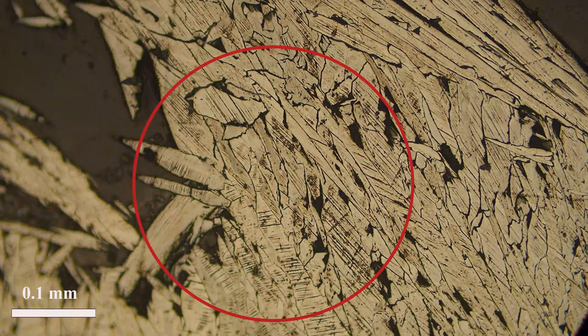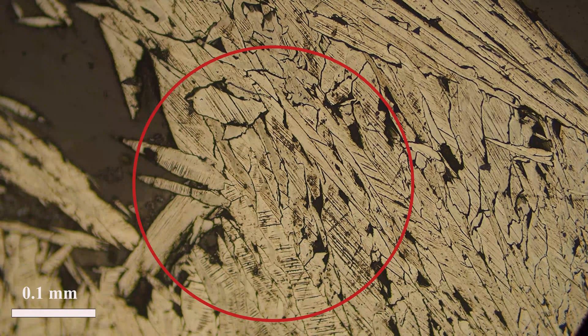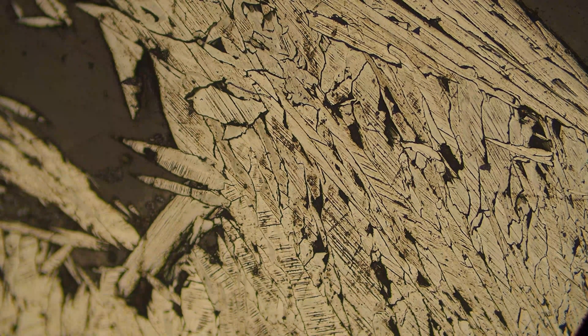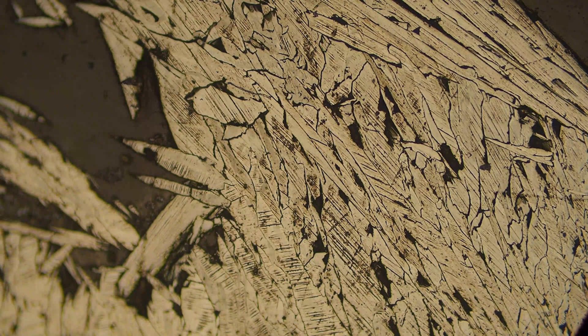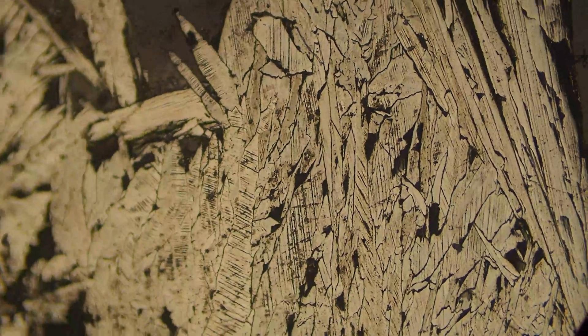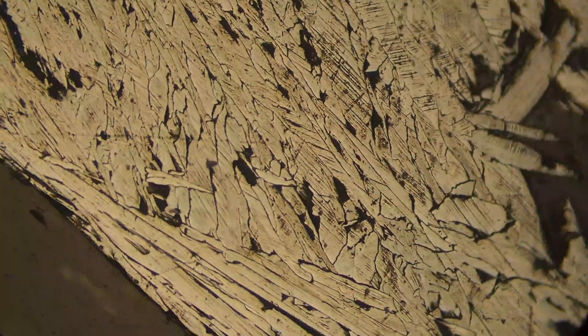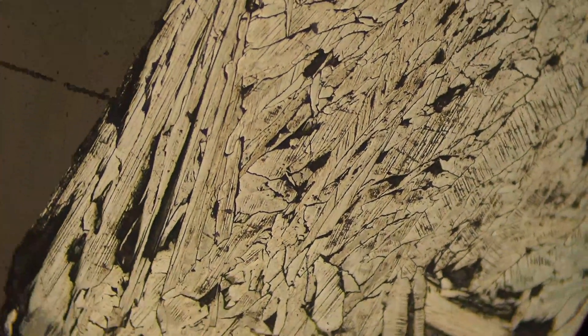Here we are zoomed in, and this might help see some of these characteristics a little bit clearer. As we rotate the stage again, especially on the edges, you might be able to see it going from a little bit paler to a little bit brighter. This is the weak bioreflectance.